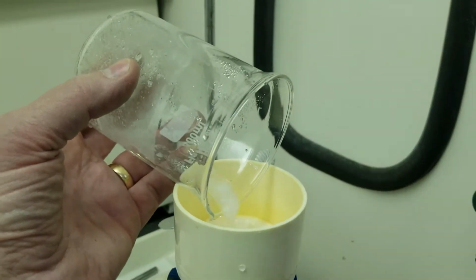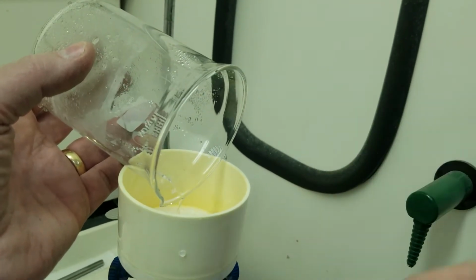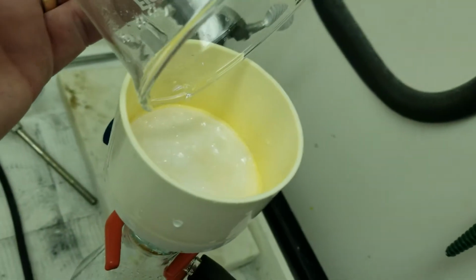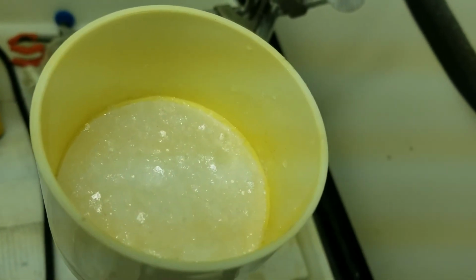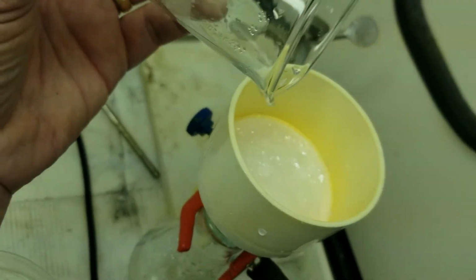I usually have to finish this up and then pour all at once. You want fast pour? Yeah, you can do that. But I got most of it, and if you look, the crystals are kind of a flat plate. They're really sparkly when they catch the light, and they almost look like snowflakes.